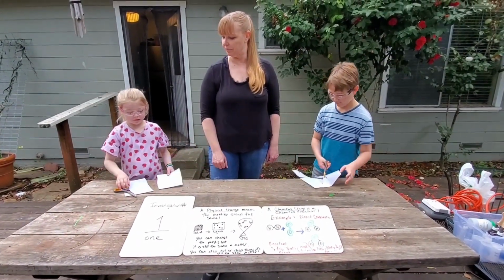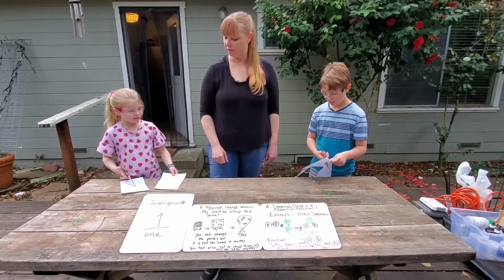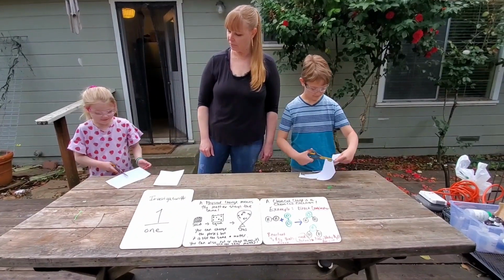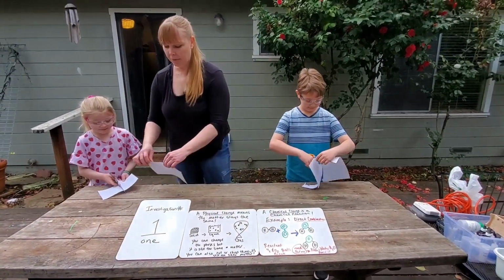Keep cutting. Smaller. Just keep doing it. And then maybe I'm tearing.